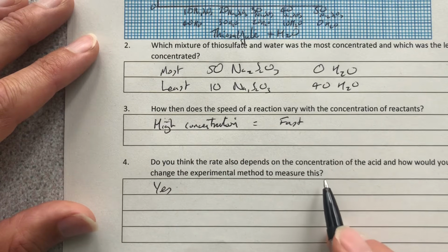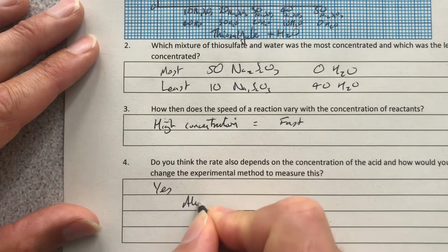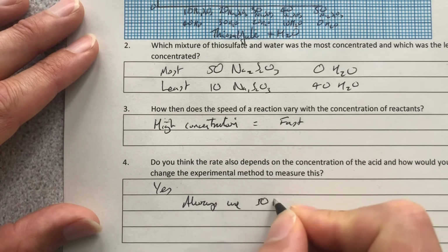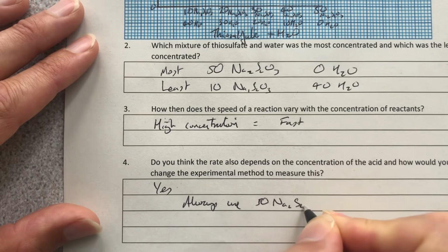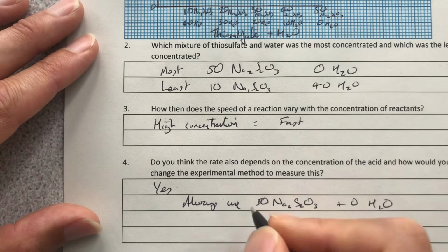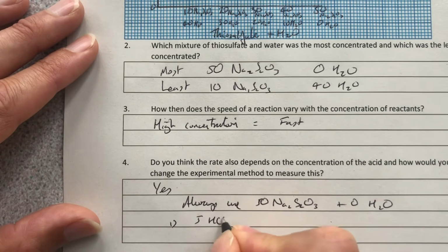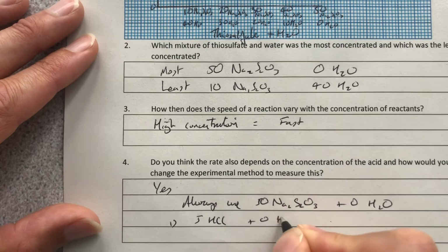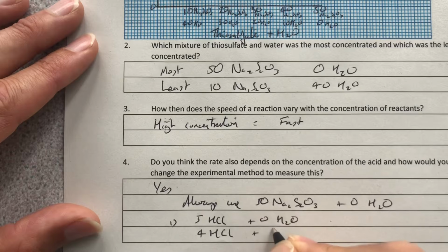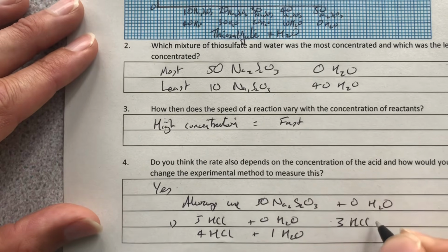How do we change the experiment to do that? Well, we'd always use 50 of sodium thiosulfate and 0 water, but then use maybe 5 HCl, 5 hydrochloric acid and 0 water, and 4 HCl and 1 water, maybe then 3 HCl and 2 water.